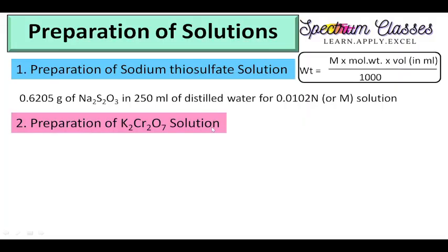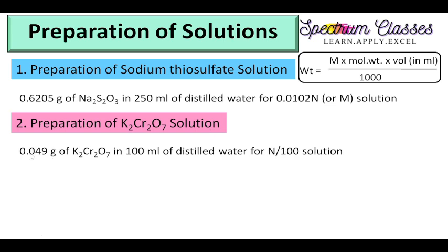Preparation of K2Cr2O7 solution. For this purpose I need to weigh 0.049 grams for 100 ml of distilled water to prepare an N/100 solution. For this calculation we need to divide its molecular weight by 6, because 6 electrons are gained by the Cr in this case. The detailed calculation for this I have given in my previous video — I will put the link here.